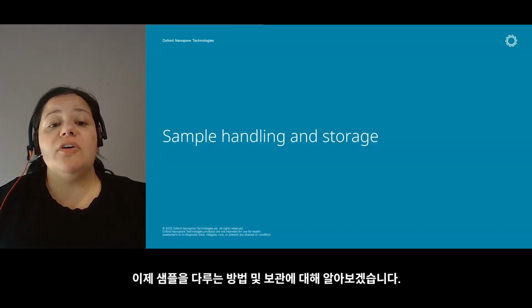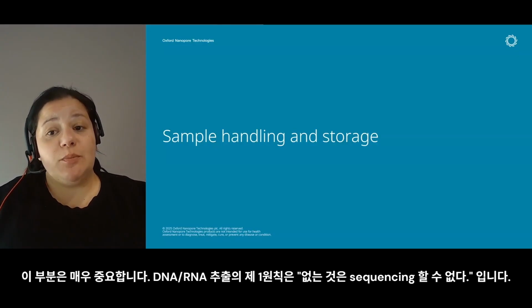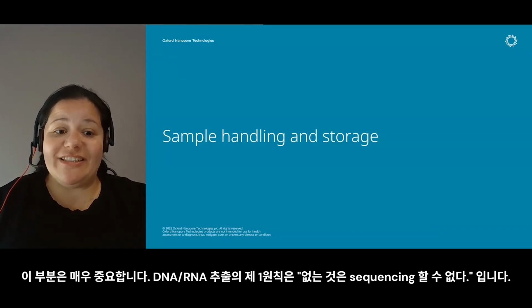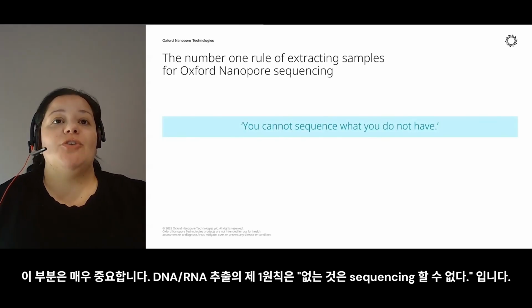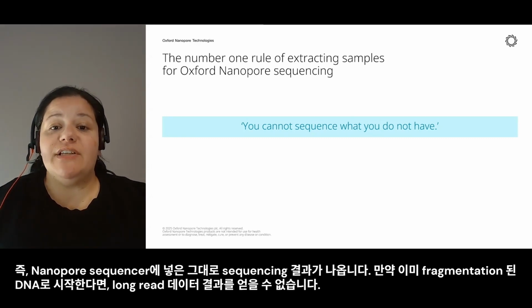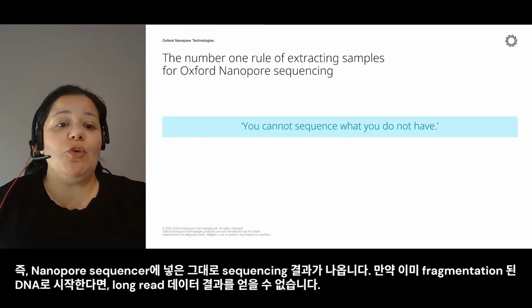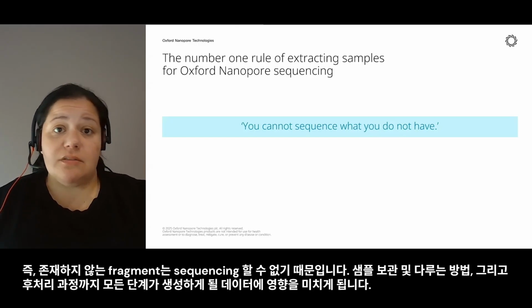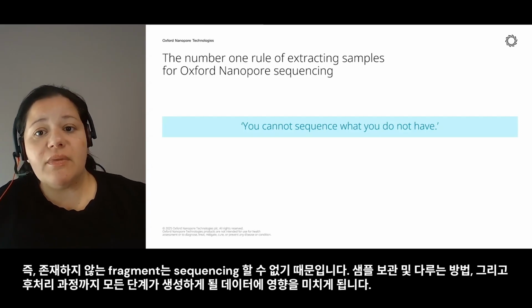Now we are going to talk a little bit about sample handling and storage. This is really important because the number one rule of extraction samples is that you cannot sequence what you do not have. So what you put into your nanopore sequencer is what you're going to get out. So if you start with a fragmented sample, you're not going to get long reads because you don't have those long fragments to start with, so you can't sequence them.